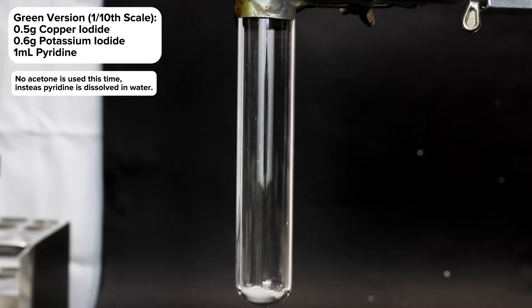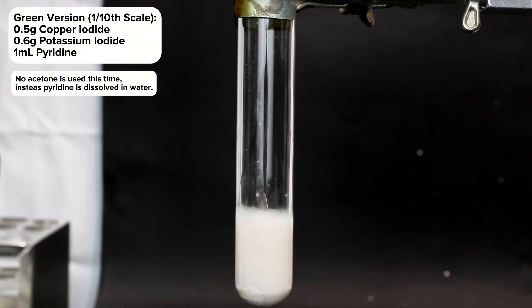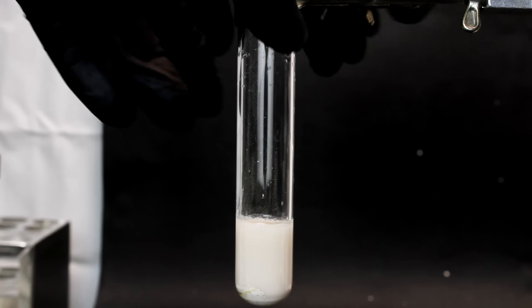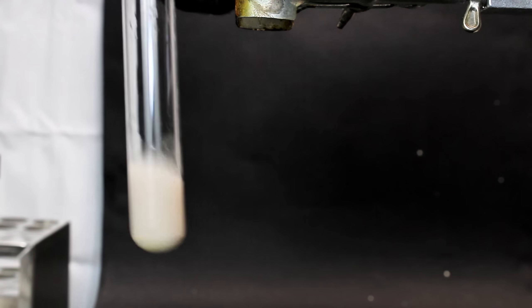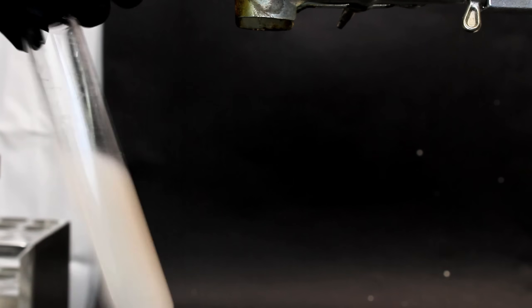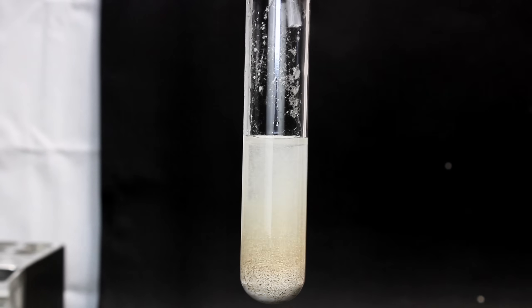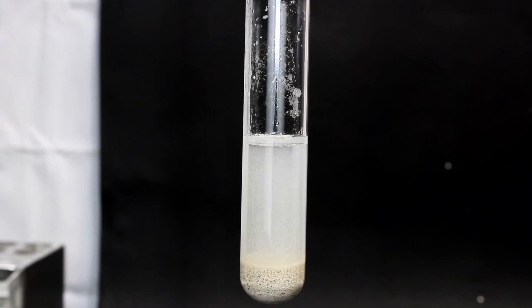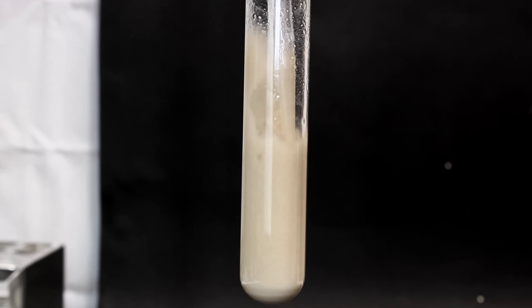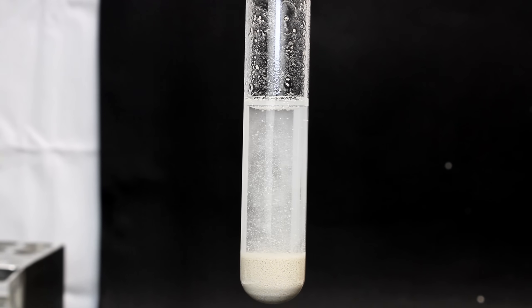Moving on to the green fluorescent version of this compound, I began by adding a half gram of the copper iodide and 0.6 grams of potassium iodide to a test tube along with a few milliliters of water. This represents a tenth scale of my first batch. In a separate test tube, I then combined one milliliter of pyridine with a few milliliters of water and swirled the test tube thoroughly to combine the two. This time I used water instead of acetone, and twice the amount of pyridine relative to the copper iodide. The two mixtures were combined just like before, but this time the resulting precipitate is distinctly yellow.